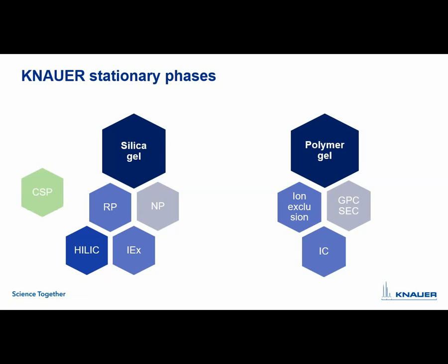They are silica gel based phases, but still they do not really fit into this family. Chiral separations and chiral phases are something very special, and they are produced very differently, and they are really used for a typical kind of application. So this is why we did a separate video for this, just to let you know the difference.